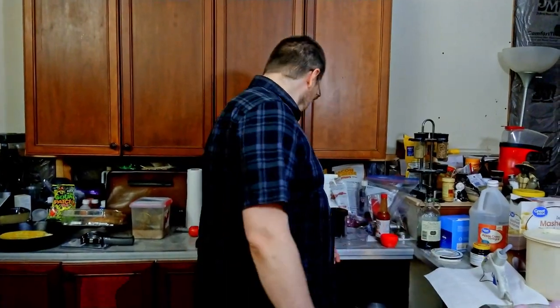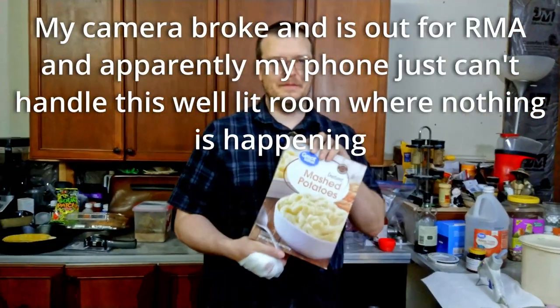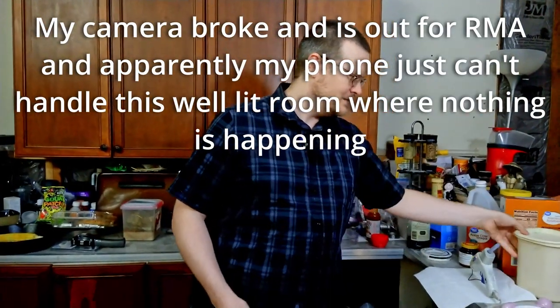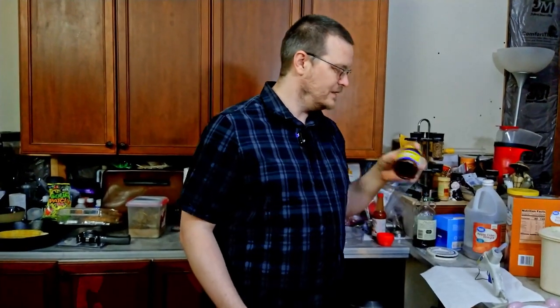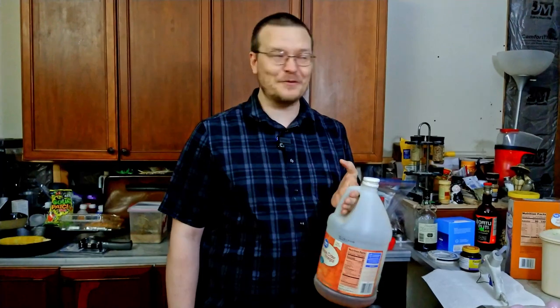So to make this work you're gonna need four things: mashed potatoes, sugar, yeast, and vinegar.